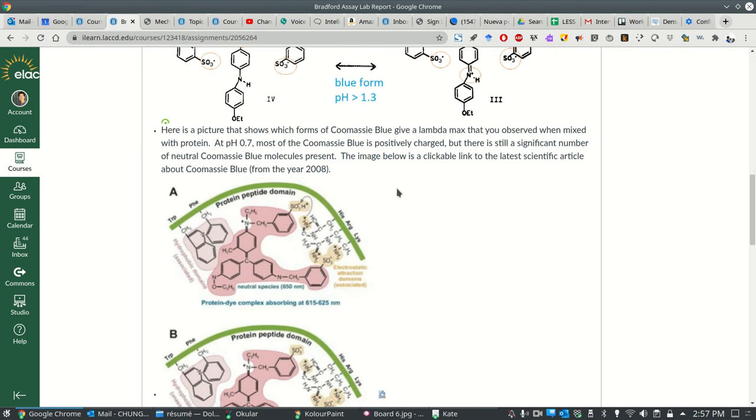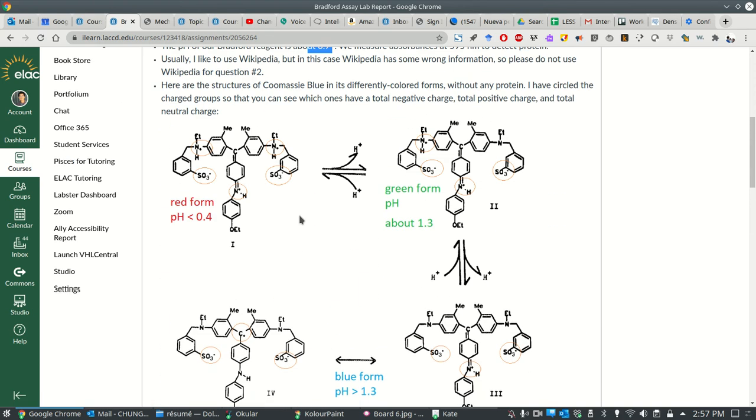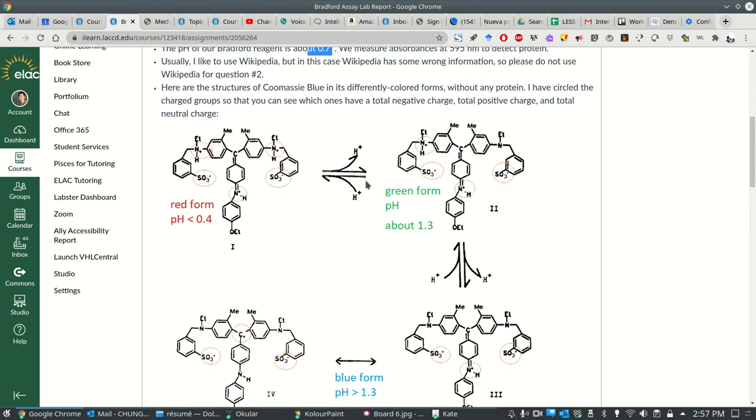find its way, just by diffusion and by the hydrophobic effect, mostly, into pockets that look like this in the protein, right? And it takes some time for Le Chatelier's principle to take effect here, where the concentration of these guys decrease because they're complexing with somebody else, the protein, and then the concentration of these guys are going to have to decrease to make this one increase again. And so a consumption, eating has to happen. Nature will eat this and spit this out, so we'll have more of this, and it takes time. That's part of the 5 minutes.